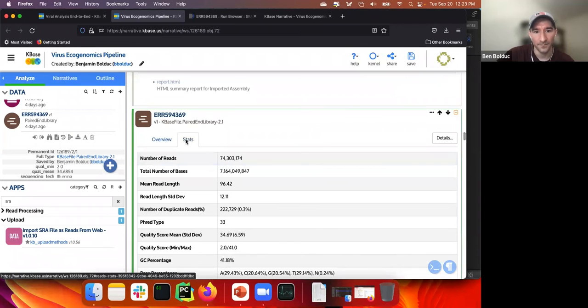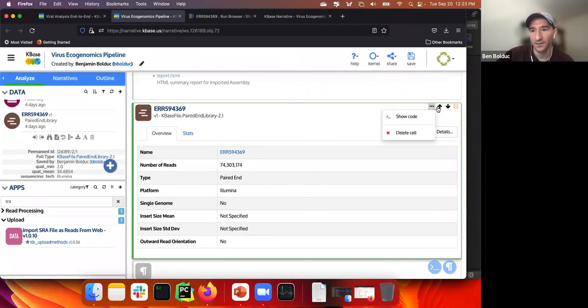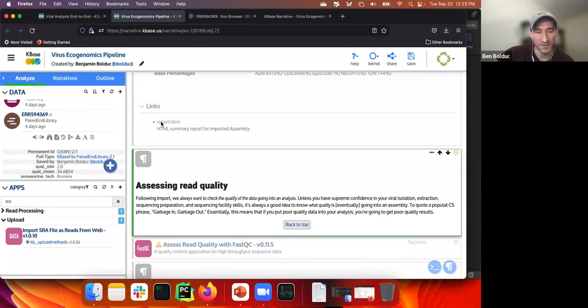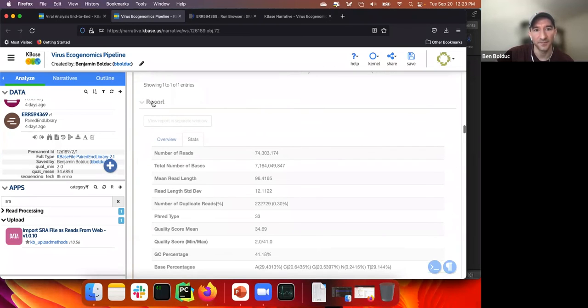Oh, okay, it's not this one. Sorry, apologize. Oops, that cell. You can get all those read statistics. That's actually what I was going to show you, but it's actually already in the report.